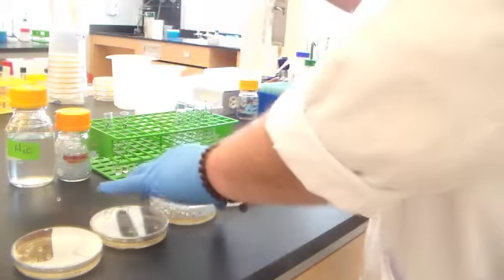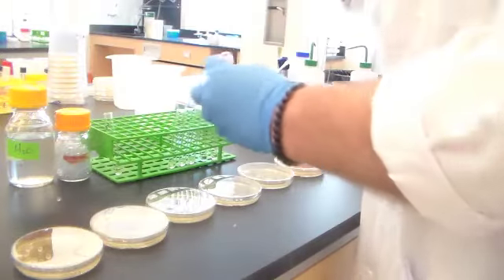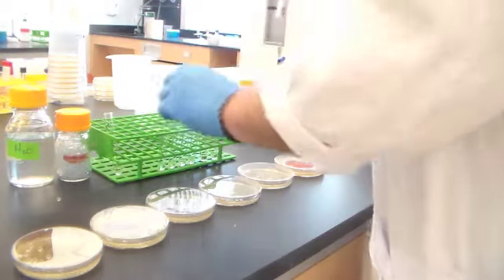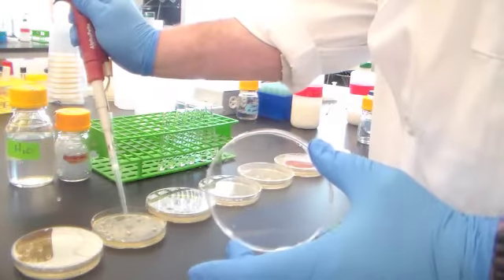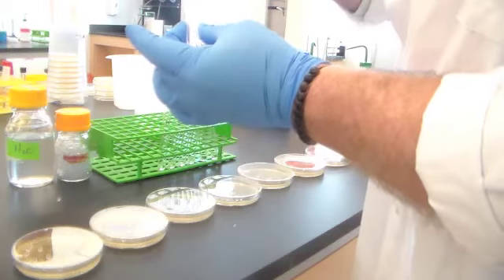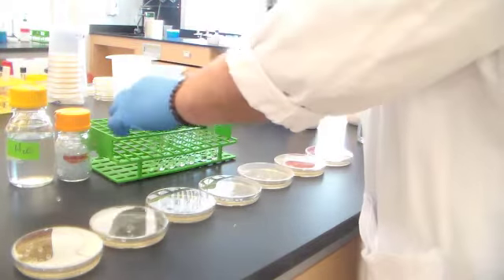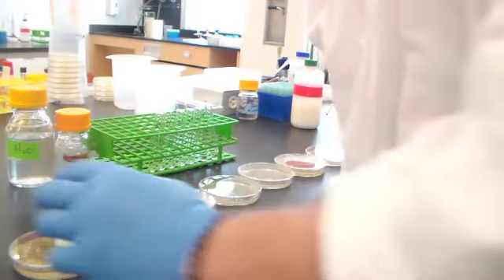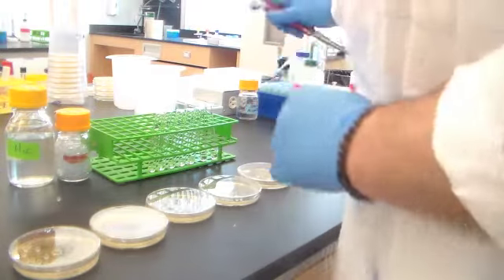That's the 1 to 1,000 dilution. 1 to 100 dilution. And 10 to the minus 1 dilution. Get rid of that pipette tip.